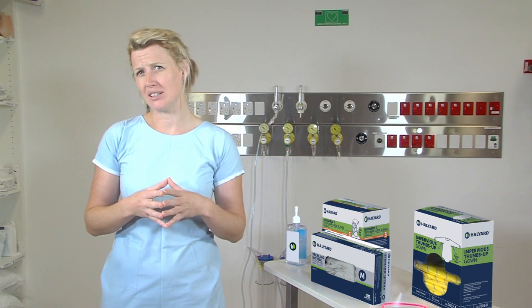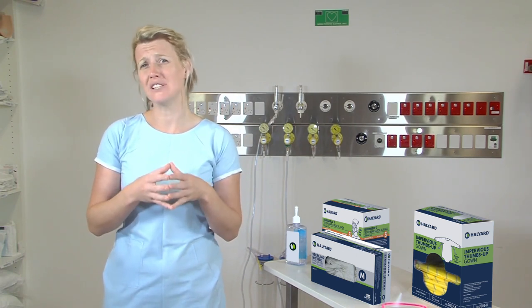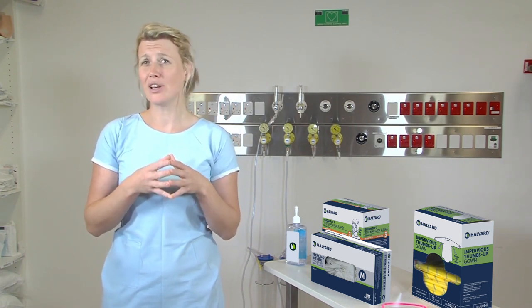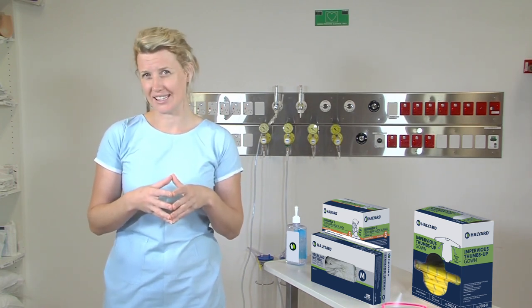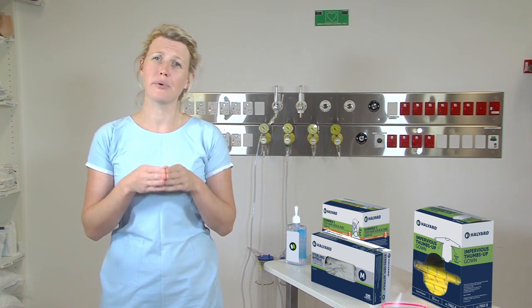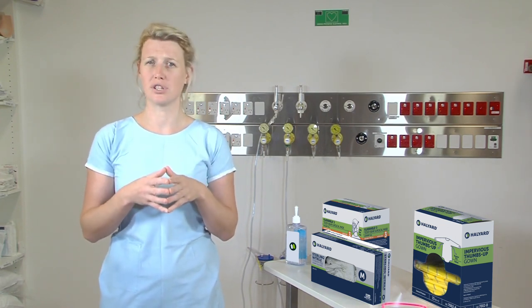The second thing you need to keep in mind: have you got the right fitting equipment? Are your gowns and gloves the appropriate size? The last thing to consider is whether you have the appropriate equipment for the level of precautions required.